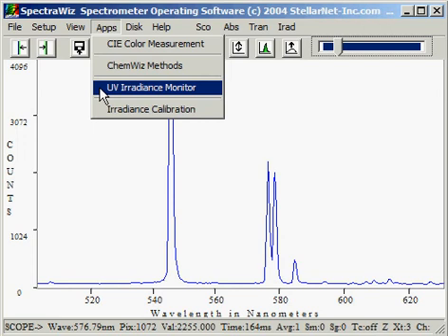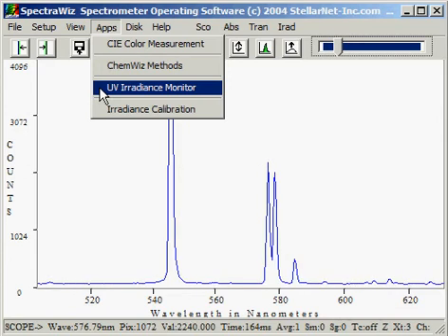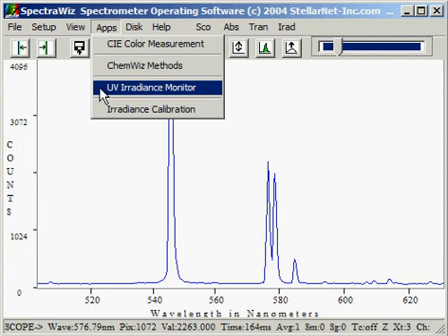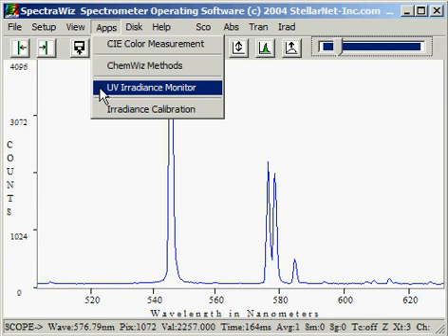The UV irradiance monitor allows us to measure the absolute intensities of UVA, B, and C, provided we have our spectrometer calibrated as a UV spectroradiometer. Additionally, the monitor will calculate the time till skin erythemic action, or till when it tans, as specified by the FDA algorithms or the Spanish Health Ministry.